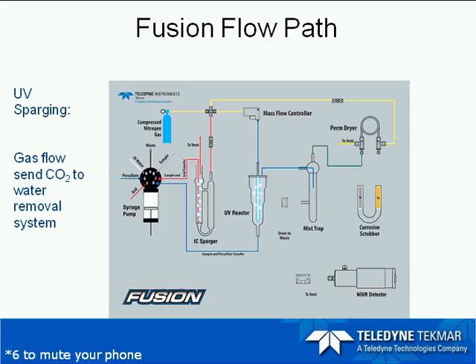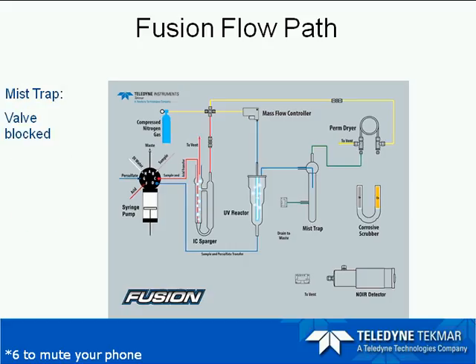That tube is permeable only to water vapor, and on the outside you have your nitrogen gas flow, which is devoid of water vapor, and so the water vapor wants to diffuse towards the countercurrent flow of nitrogen, and that's the way the perm dryer works. It's a Nafion tube. As the gas continues to flow through the perm dryer, it'll next go on to the corrosive scrubber.